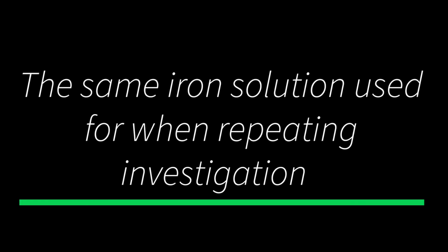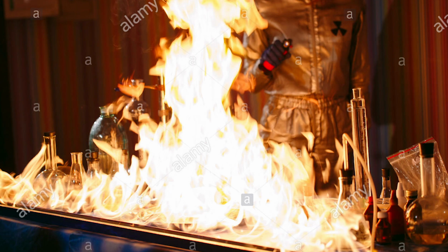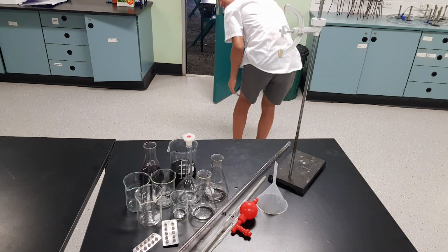the experiments for reliability. Before conducting the experiment, I have predicted that the results achieved will not be accurate or near the actual mark, as I in no way have any experience in this. The materials required for this titration will be a 50 ml burette, 25 ml pipette, 3 250 ml beakers, 250 ml conical flask, 2 250 ml volumetric flasks, funnel, potassium permanganate, sulfuric acid of a strong concentration, retort stand, burette clamp, and 2 brands of iron tablets.